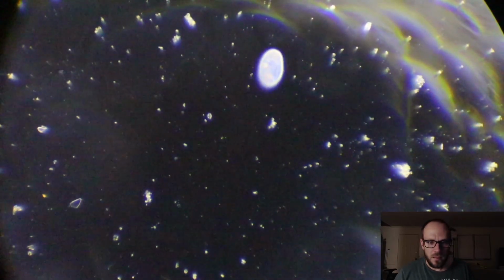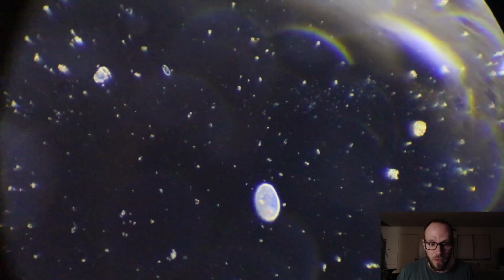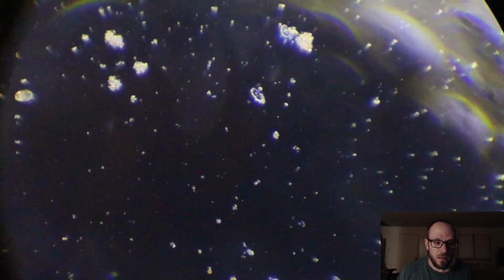And I'm just so happy that I have a slide where I've kept this alive for about a month now. So naturally, he's probably the 8th generation of whatever fat cell he is. But yeah, big old chonker. Anyway, back to 40x, because there's other cool stuff on this slide. So I'm actually wondering, is this my favorite slide? Maybe not. I think it might be my second favorite one, because I thought the big chonkers were on a different slide. Anyway.